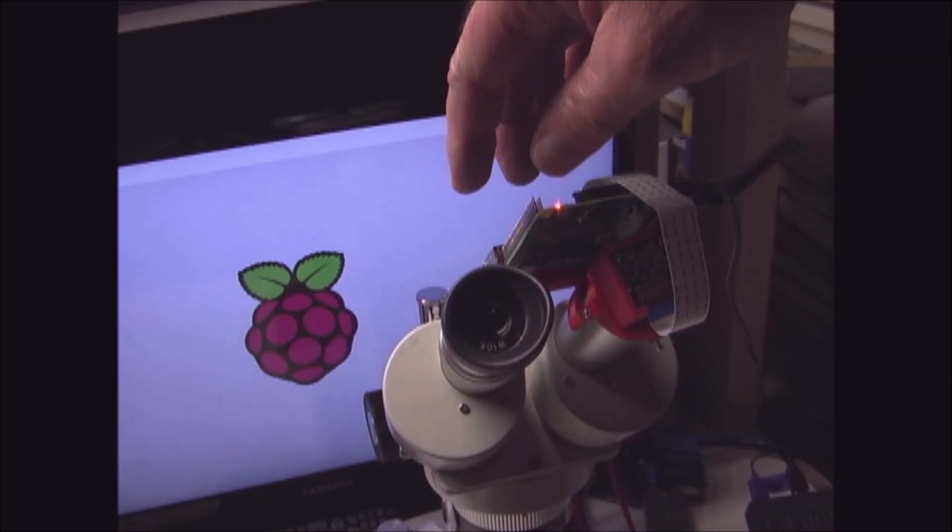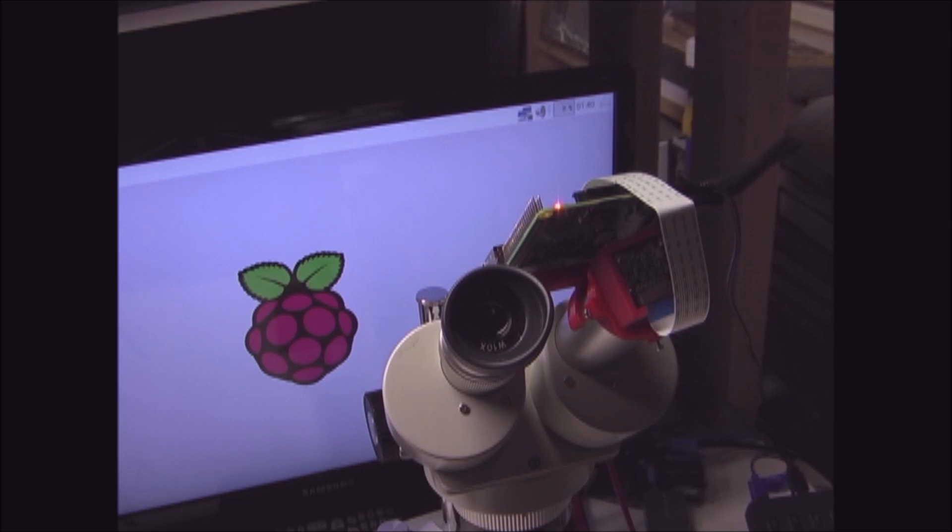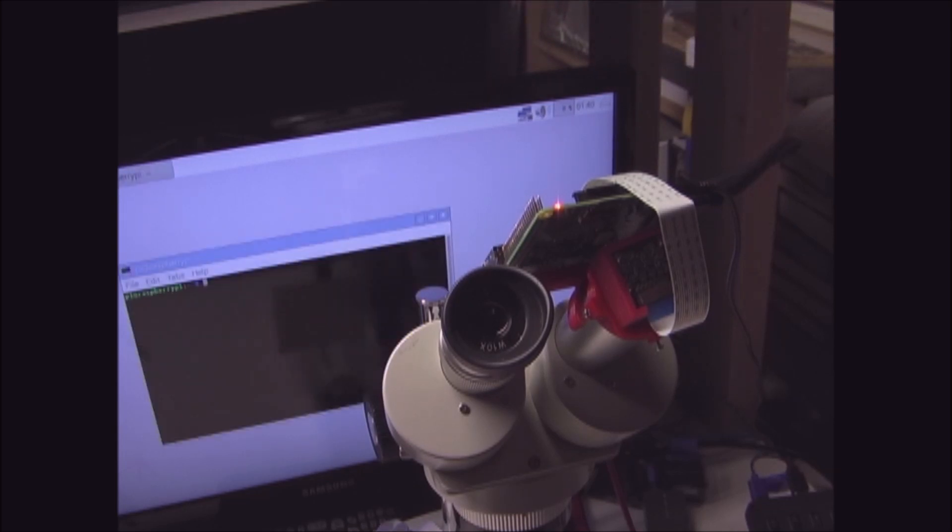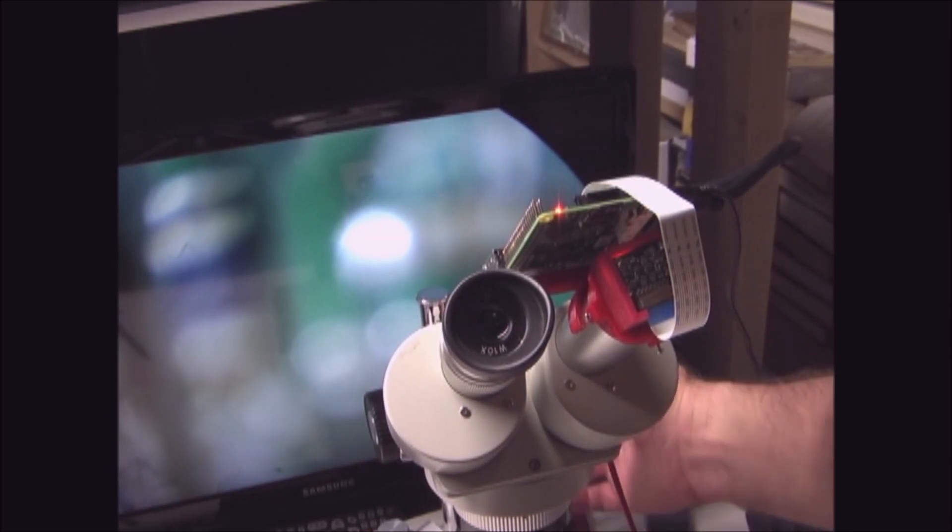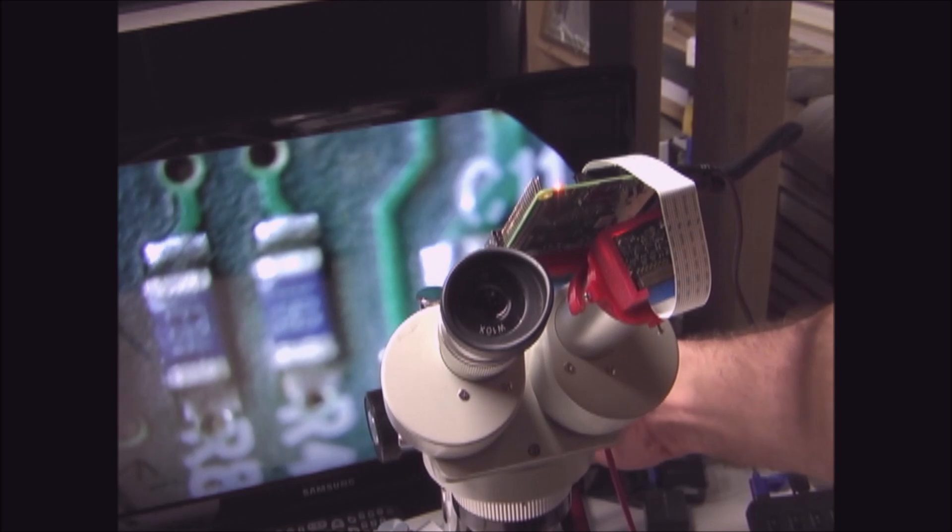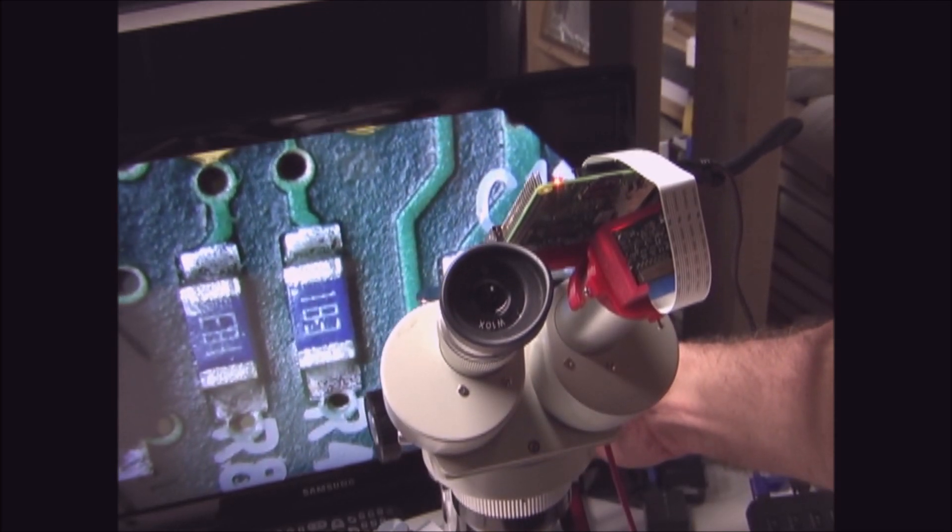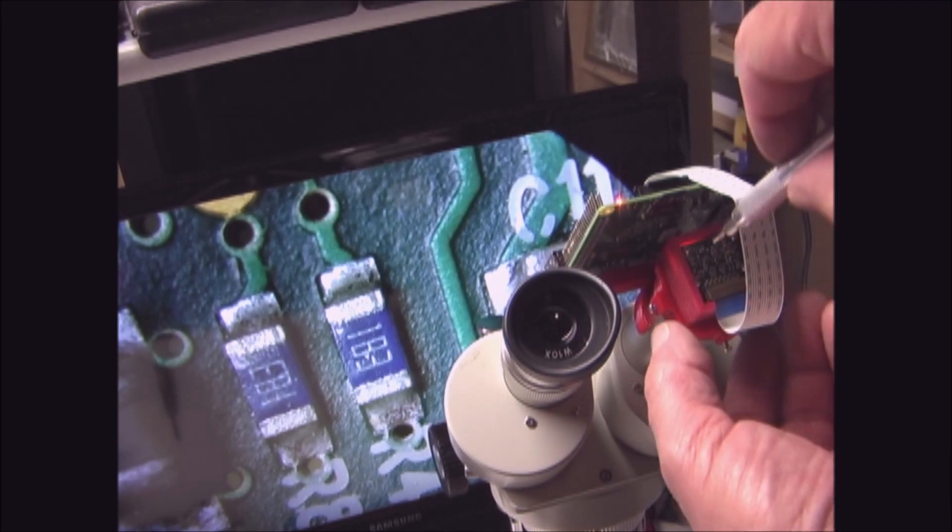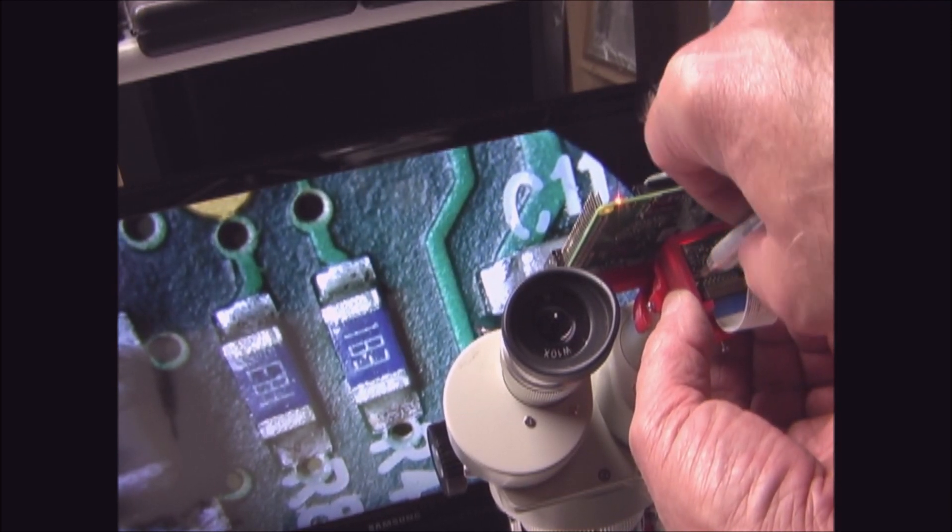Now that I have the Raspberry Pi and the camera attached to the microscope, I'm going to turn on the camera. And now I'm going to adjust the microscope. Next I'll fine tune the camera mount and the lens.